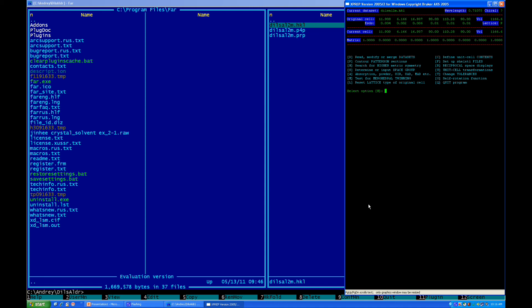What the xprep doing after that, it's pretty much walking you through determination of unit cell, and setting the files up for the structure solution. Majority of the time, sometimes, you just need to press enter, enter, enter, enter, and so on.